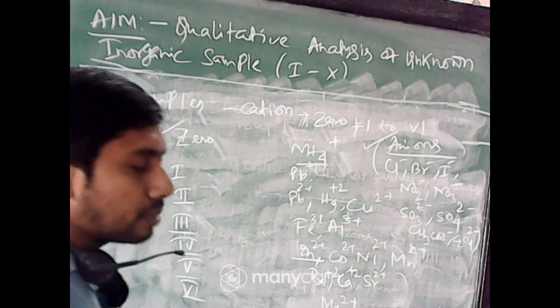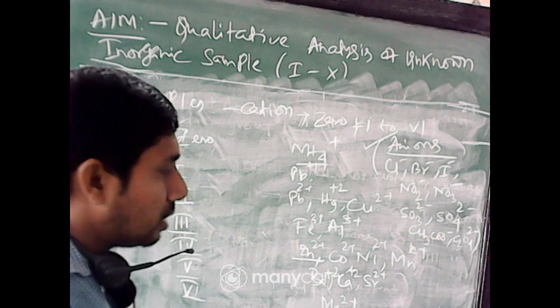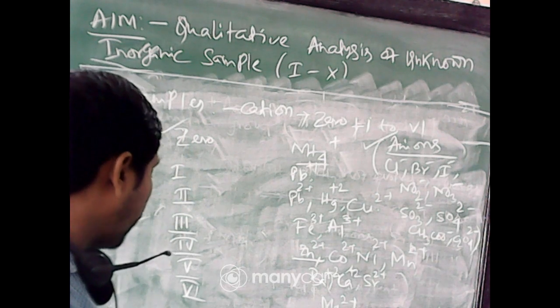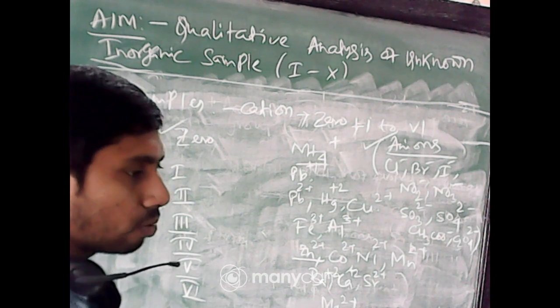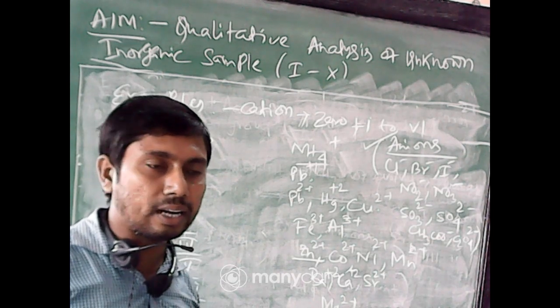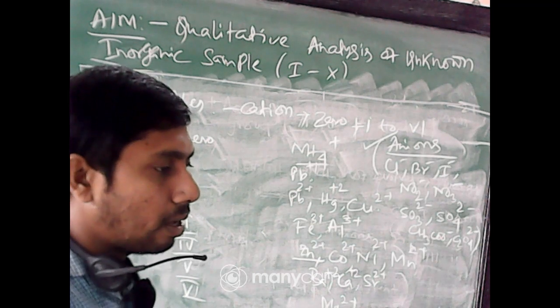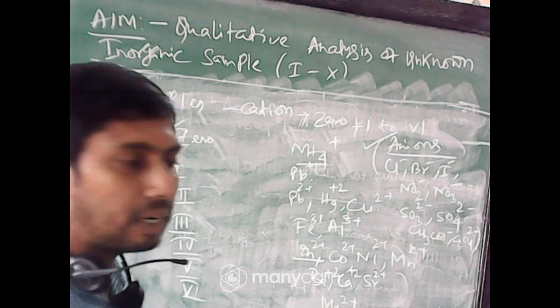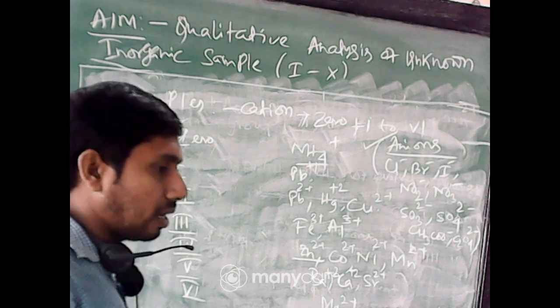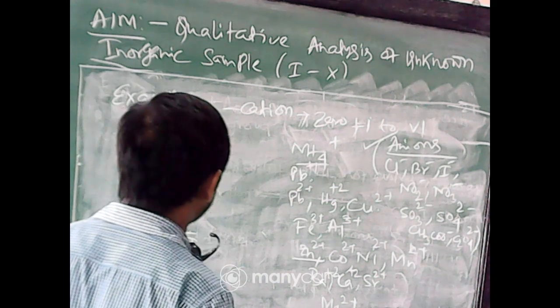And in the PDF uploaded to this group, if you move to the bottom, the last 2 pages, a sample is given showing how to write this. At the bottom there is an unknown sample treatment given. Suppose this is for magnesium sulfate, so it will also help you to understand this.